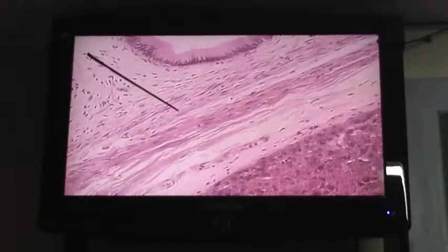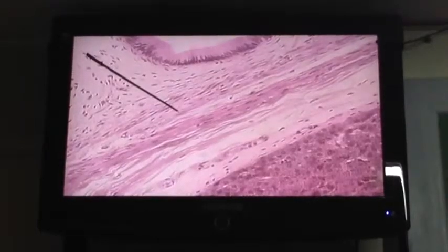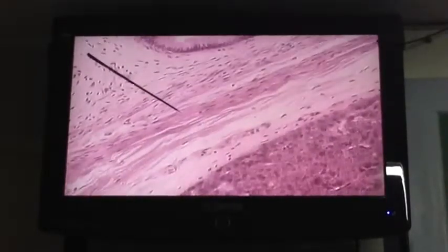Okay. The next layer is the fibromuscular layer shown at the pointer, from this point to here. We'll go back to that later. And then the perimuscular layer here. Okay? Now, the outermost is actually a serosa or adventitia.